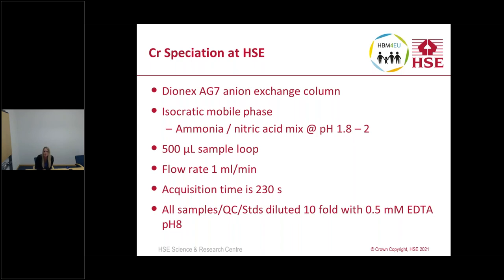The sample loop that you just saw was 500 microliters. The flow rate is 1 mL a minute, and the acquisition time is 230 seconds. The samples out on site had been diluted tenfold with 0.5 millimolar of EDTA, so the QCs and the calibration standards were treated exactly the same.